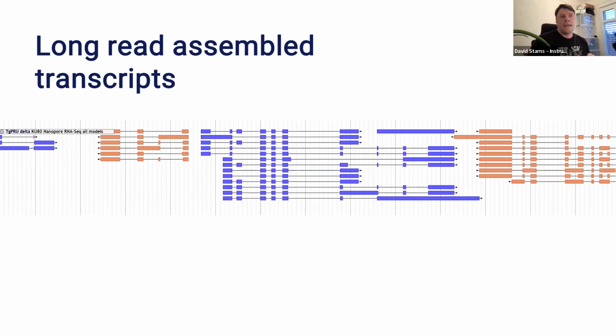And of course, even though it's long read data, you may have some degradation of the mRNA beforehand in the library preparation or anything. So it's not 100% accurate, but it is very good.